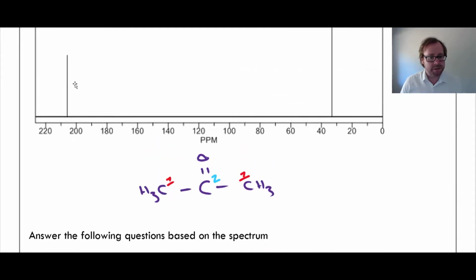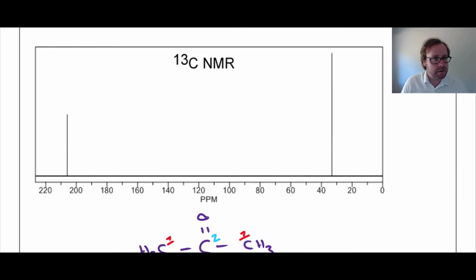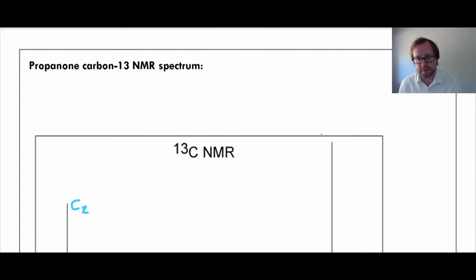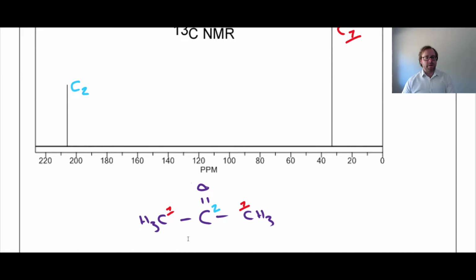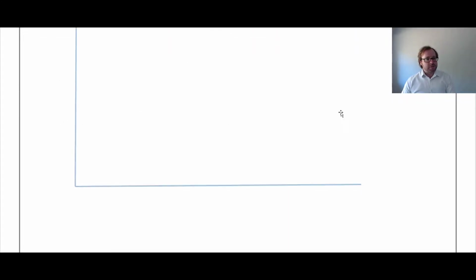So this must be my C2, which is what I have here, and this must be my C1. Okay, right, moving on.